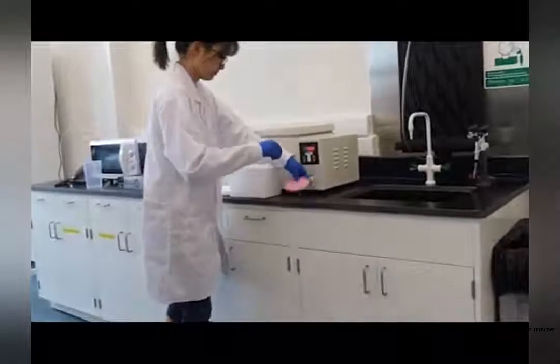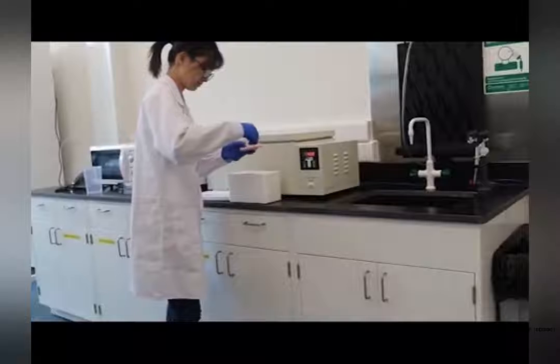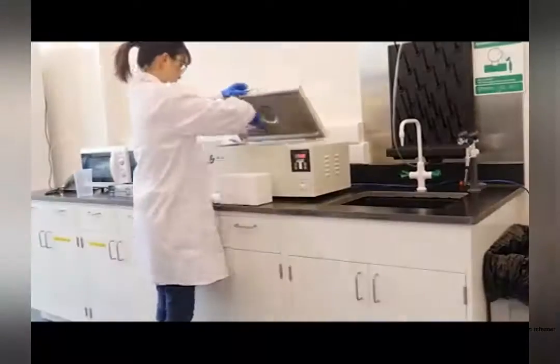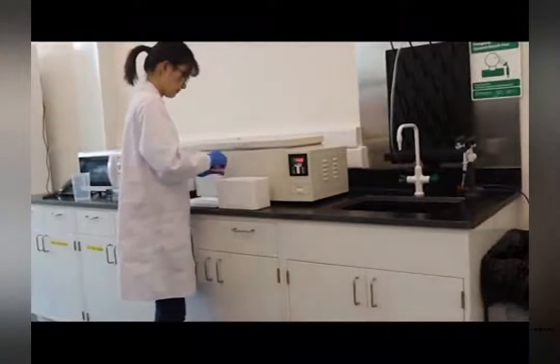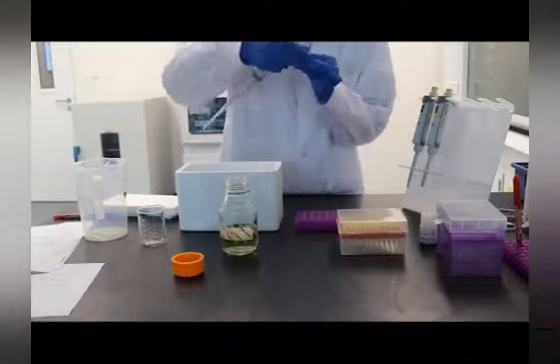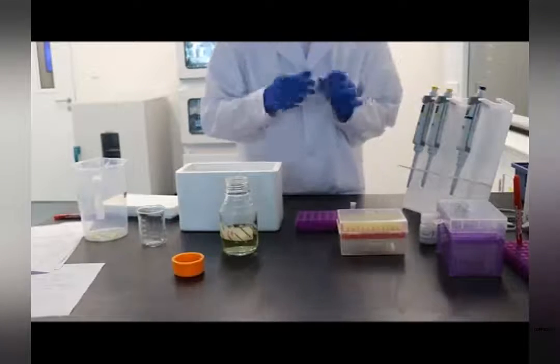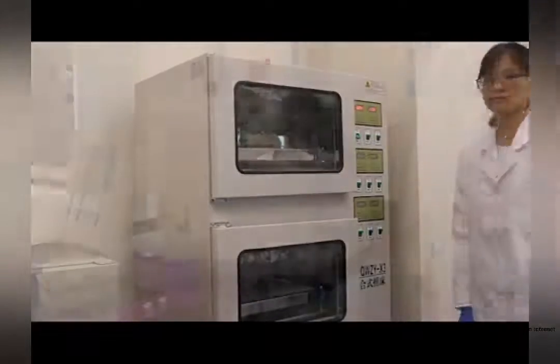Carry the ice container over to the hot water bath, which is set at 42 degrees. Insert both tubes into a float and immediately place the float into the warm water for exactly 45 seconds. After 45 seconds of heat shock, return the tubes to the ice container and incubate them for 2 minutes. Pipette 500 microliters of LB medium into each tube. Gently mix the tubes by tapping them with fingers. Incubate both tubes for 20 minutes in an incubator set at 37 degrees and 200 RPM.